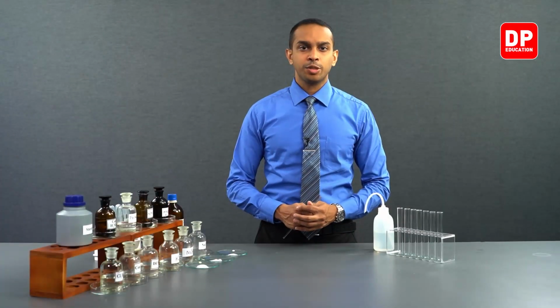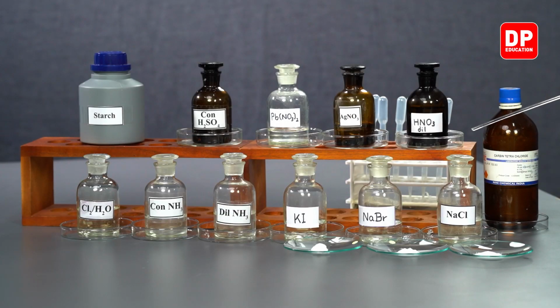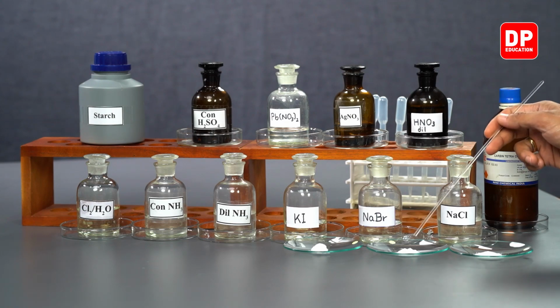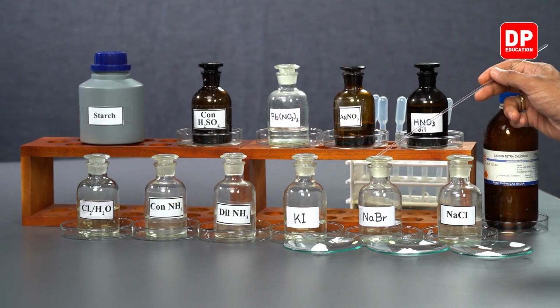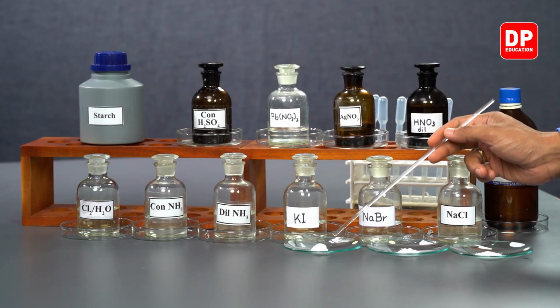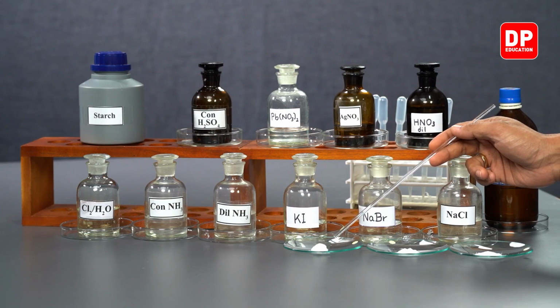To carry out this experiment, these are the reagents that you would need. We would be using sodium chloride solution, which is made out of sodium chloride solid. As you can see, it's a white color solid. We'll be using sodium bromide. Again, in front of it is the white color solid that we use to make this solution. We'll be using potassium iodide. Again, potassium iodide solid is in front of the solution, which is a white color solid.